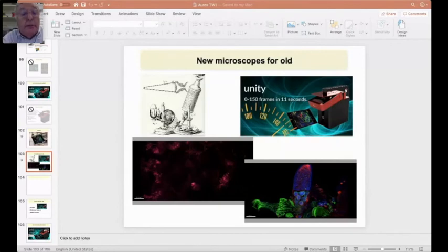Because quite clearly there was no laser or anything. And a candle, perchance? No, well, sort of. A rather well-known candle called the Moon, or rather called the Sun. He took the microscope up into the high Tatras mountains and used the Sun as the light source.